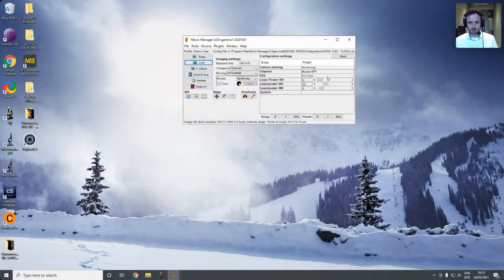If we move to the right, we can see the controls for the system. First of all, I made some binning options for the camera, since this camera uses a lot of pixels. At 100x, we could apply some binning if needed.